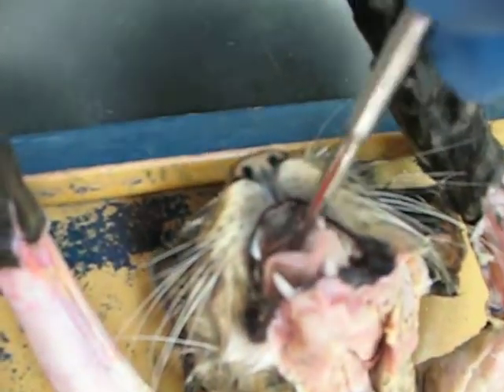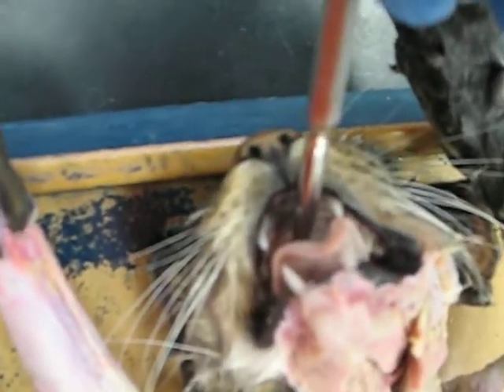You have the hard palate, which is the beginning of the mouth, the front. Way down in the back where it gets soft would be your soft palate. Underneath the tongue, the attachment point right there is your lingual frenulum.